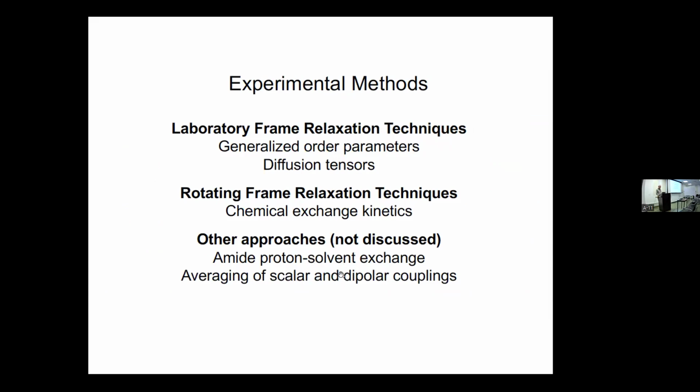At least today, I'm not going to talk about amide proton exchange or averaging of couplings, and particularly averaging of dipole couplings, which have become an important technique. So we probably should say something about it sometime other than today. Amide proton solvent exchange used to be super popular, and then to some extent, maybe relaxation dispersion experiments have taken over from it.